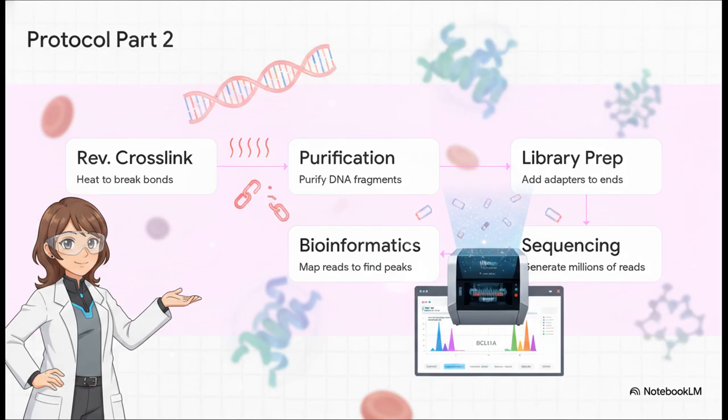Okay, so once we've isolated our target, we move to the second half of the workflow. Step 5 is reverse cross-linking. We use heat to melt that freeze we created earlier, breaking the bonds and releasing the pure DNA. Step 6 and 7 cover DNA purification and library preparation. Then step 8 is sequencing, which generates literally millions of DNA reads. And step 9 is where all this hard work pays off: bioinformatics. The software sifts through all those millions of reads to find what we call peaks. And these peaks, they are the enriched regions that prove exactly where our protein, BCL11A, was bound.